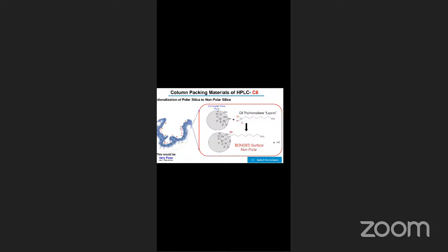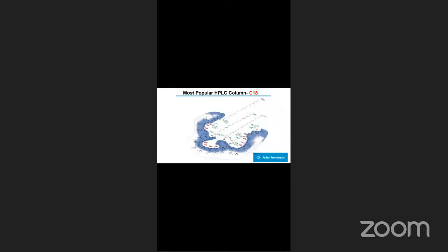And then if you go to the packing material, what is in the packing material? They will say, I have a C8 column. They will say, I have a C18 column. What is the C8 column? C8 column is nothing but the length of the aliphatic chain that has been attached to the silica, to the OH in there. If it is attached with the C8 length, we call it a C8 column. If it is attached with the C18 length, we call it a C18 column.